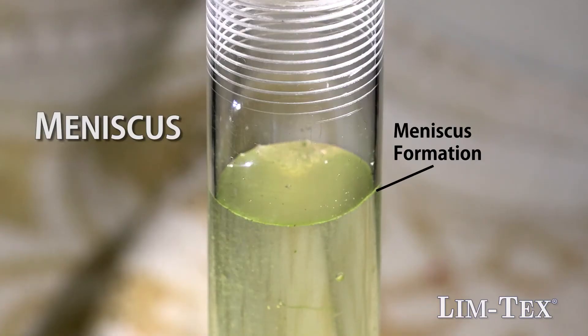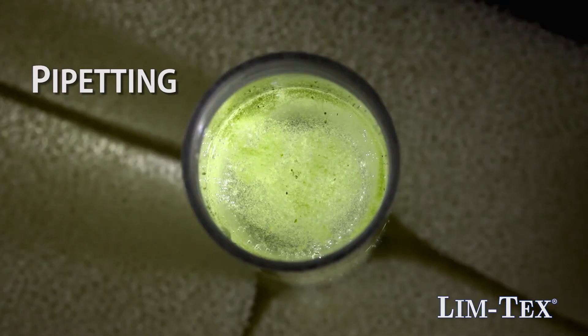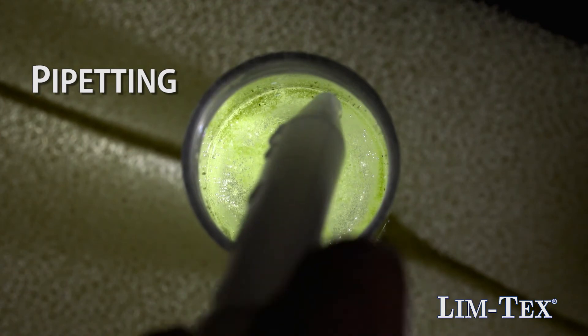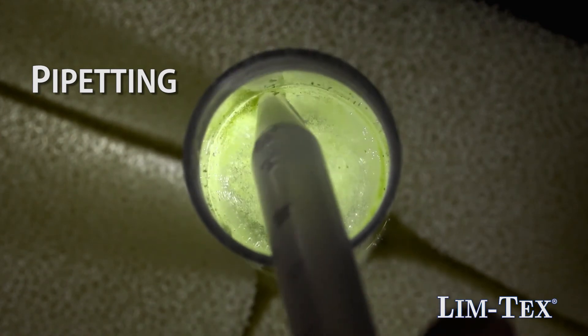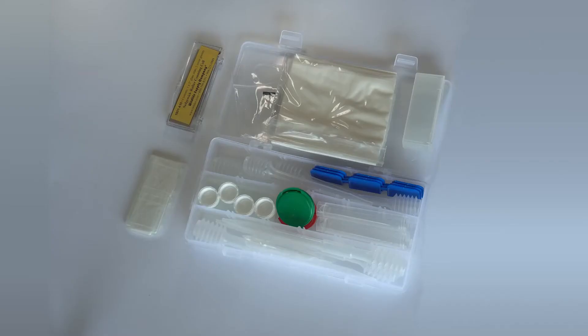This allows the bloom material to gather at the surface, forming a meniscus layer, making it easier to harvest a bloom sample. The easiest way to harvest a bloom sample from the zapper is to use a pipette, which is included in the microscope collection kit.